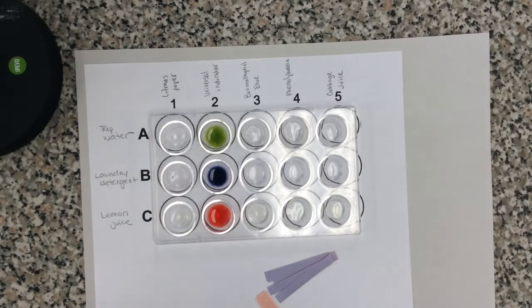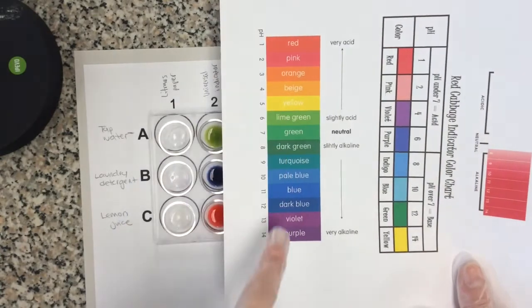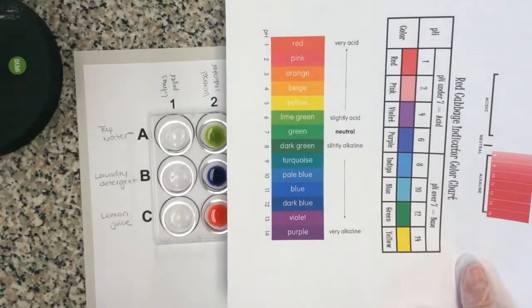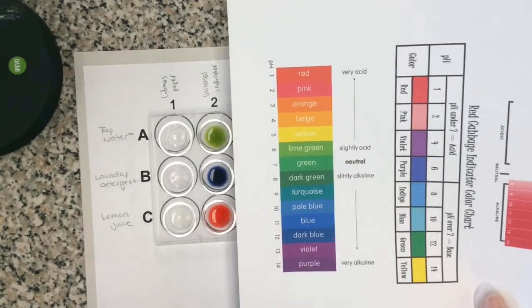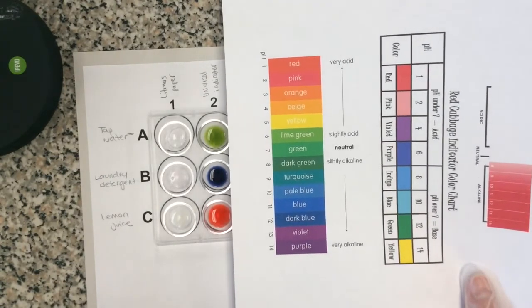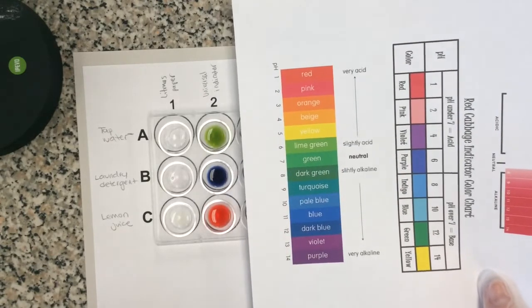Okay? So our universal indicator here has lots of different options. And when you color match it, we can actually figure out what the pH is, and that means how strong of an acid or a base it is. So all you have to do is go ahead and color match. I'll help you with the tap water and you guys can do the remaining ones.